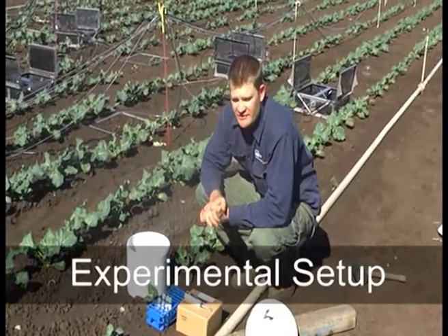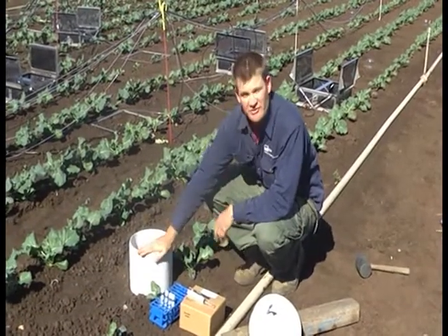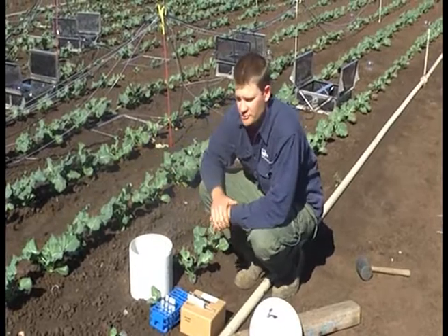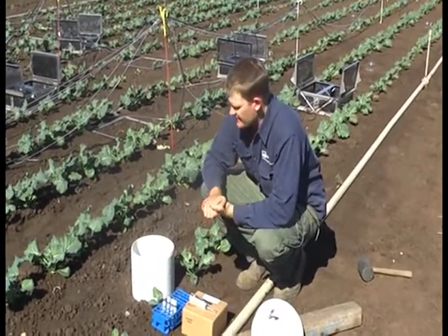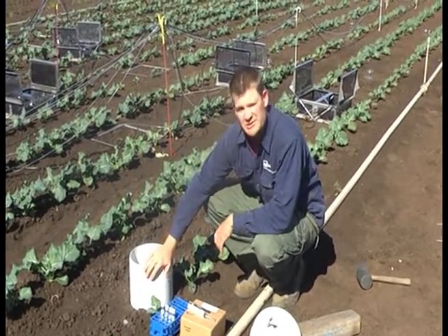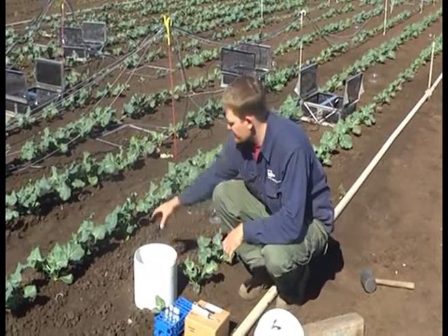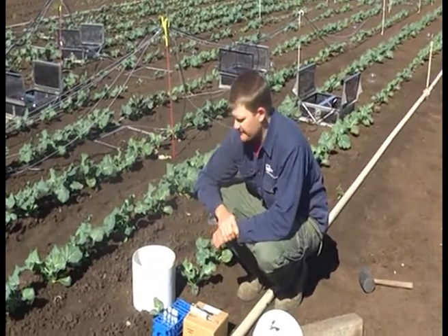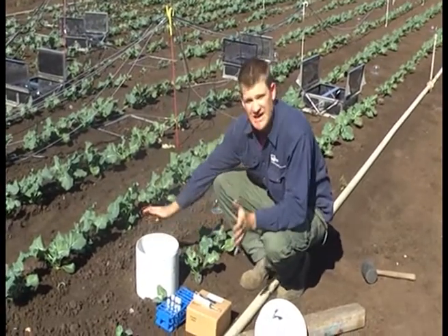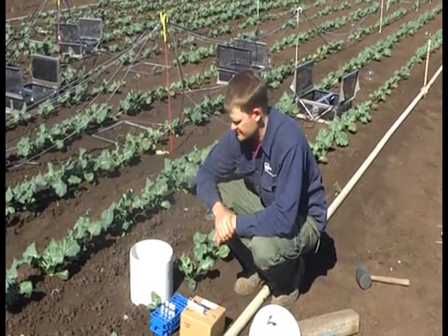When we design our experimental set-up, it's very important to think about first of all the number of replicate chambers we need per crop or per treatment, and also how often we sample those chambers. Typically we want a minimum of six replicates. You could get away with four if you're measuring in both positions, but six is ideal simply because it covers a larger surface area. Obviously the bigger the chamber the better, but in this case we're using this size chamber, so we recommend six replicates.